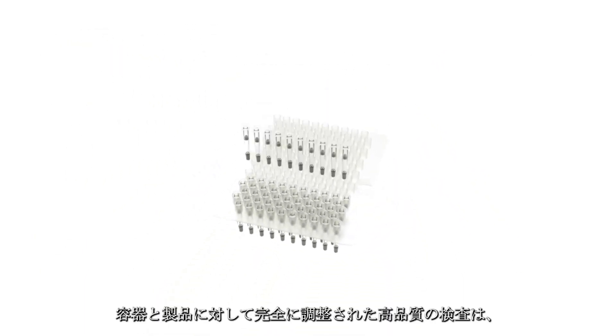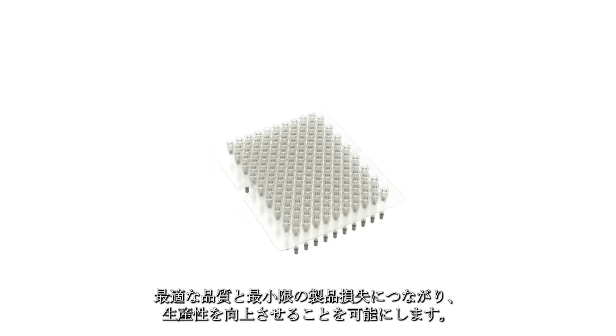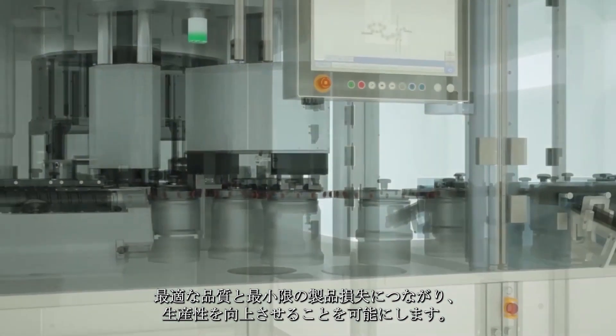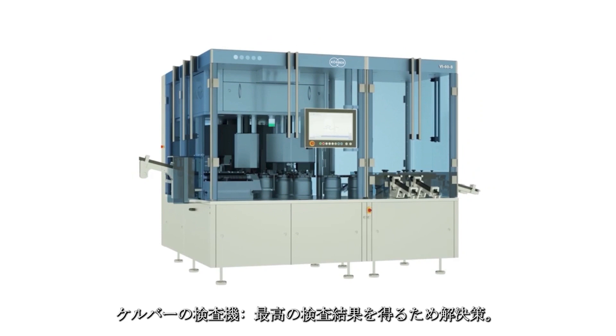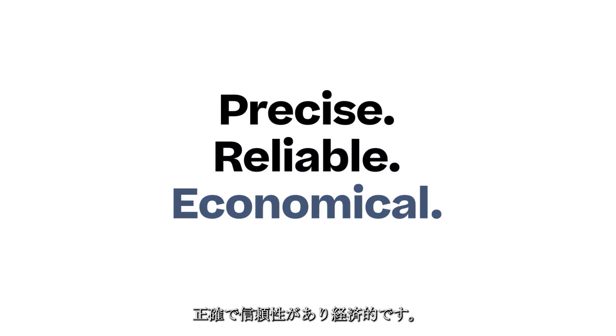High quality inspection, perfectly aligned towards the container and to the product, enables an increase of productivity with optimal quality and minimized product loss. Körber inspection machines – the solution for the best inspection results. Precise. Reliable. Economical.